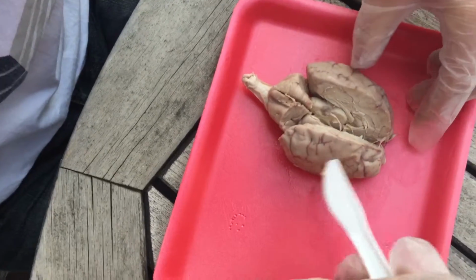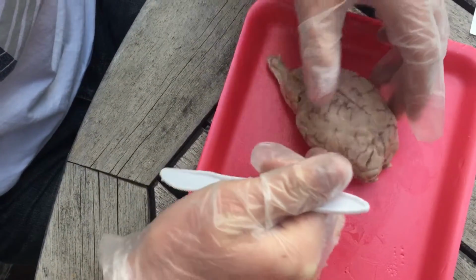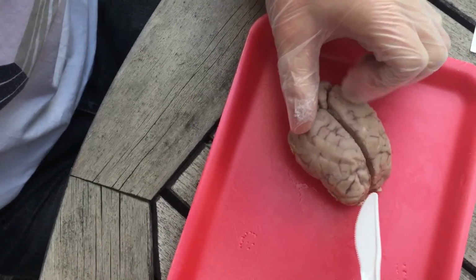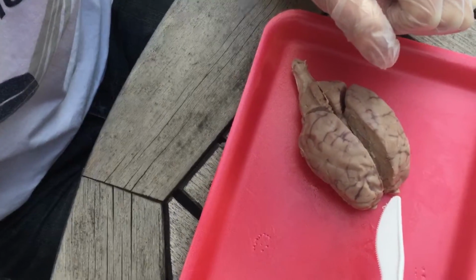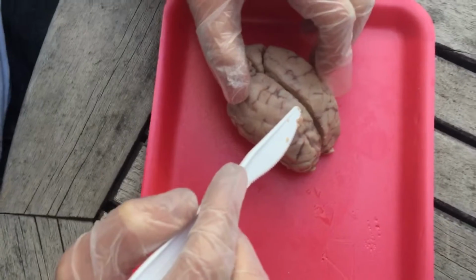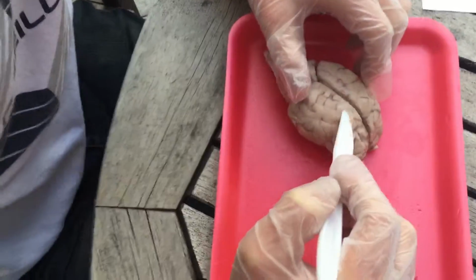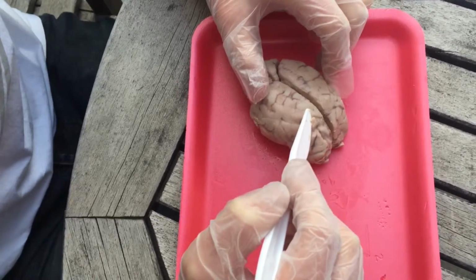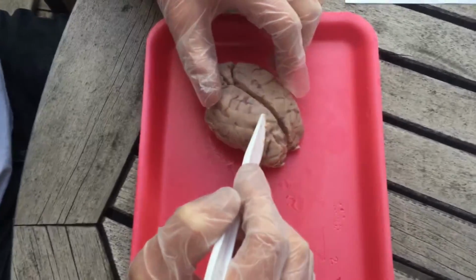And then we have the frontal lobe, which is here. The frontal lobe is where the emotions, planning, and problem-solving abilities come from. And then this is the parietal lobe. This is the top area of the cerebrum and is associated with recognition and movement of the body.